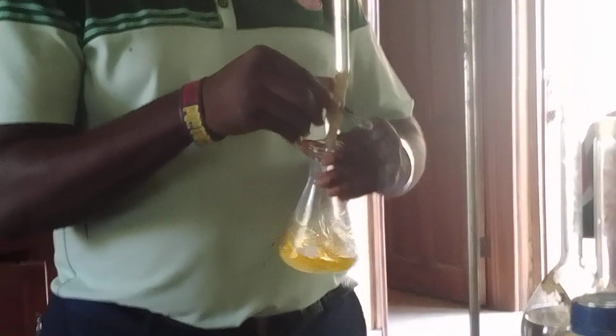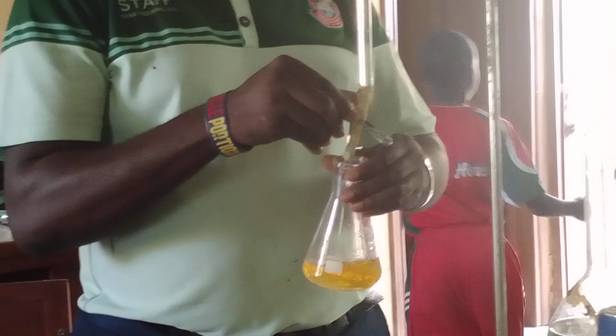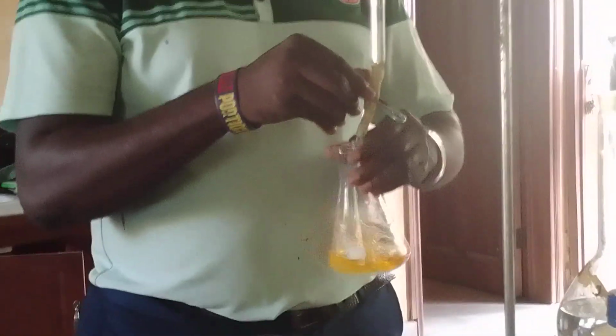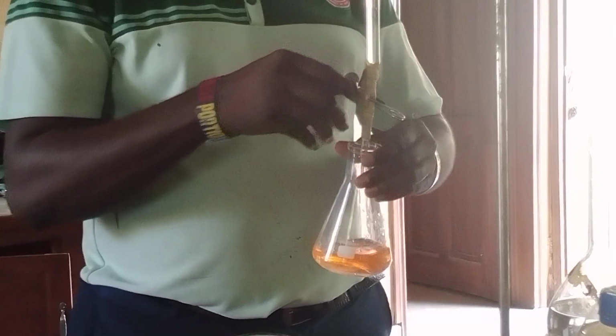And you can see that the thing is already trying to change. It's already trying to change. So very soon, you see the pink color. Yeah, it has changed now. You can see, look at the color, the pink color. This is a pink color now.